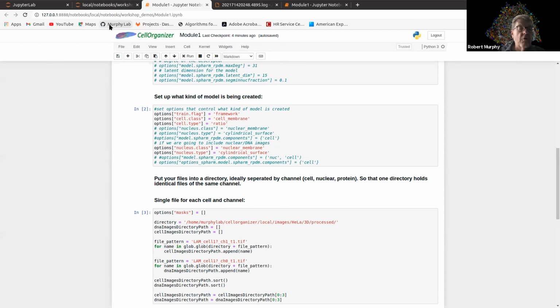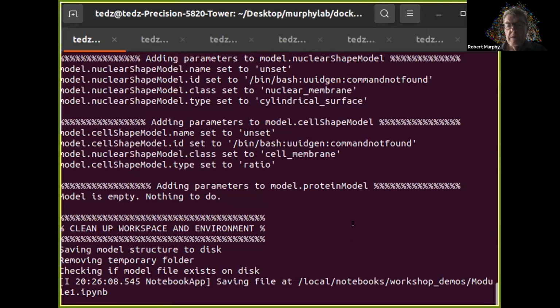Okay, so inside of terminal, you're going to run the Docker container. Ted, do you want to share that? Share the same terminal that you had open that ran previously. All right, you know what? I can share mine. Sorry, it took a while to upload the Docker, because it looks like it's several gigabytes.